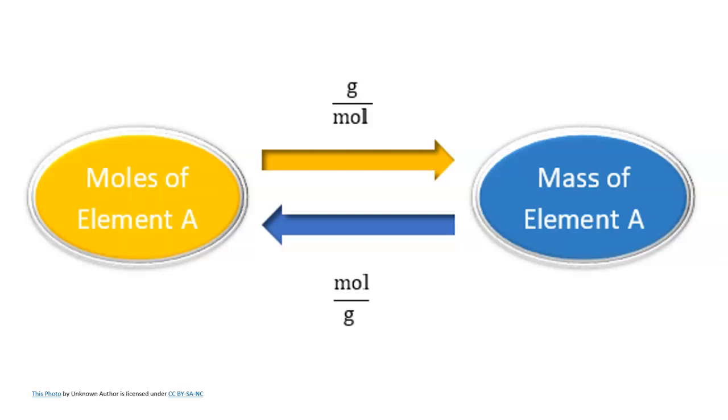You're going to get a chance to make a chemical solution, which is always cool. You're also going to figure out how to do a proper titration to find the molarity of your solution. And then you're going to learn how to use a known solution molarity with volume data to find the molarity of a second solution.